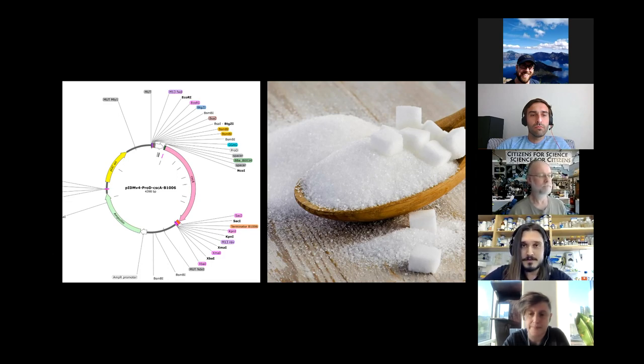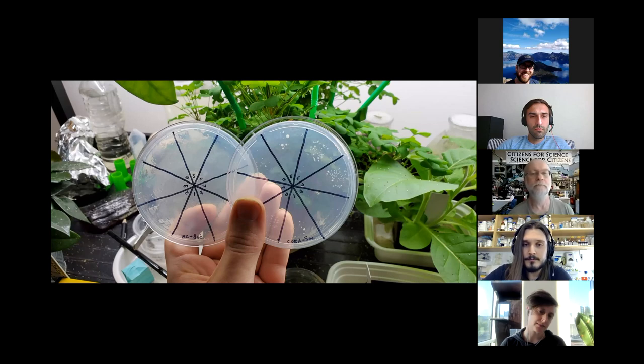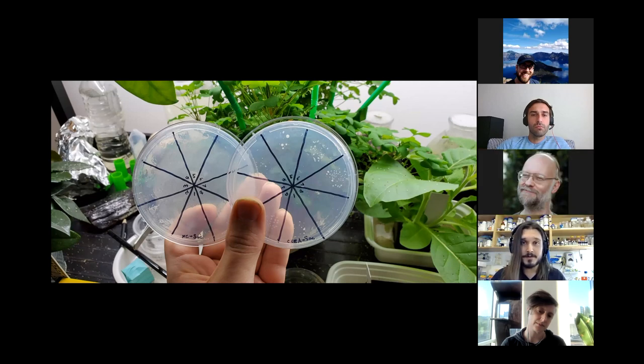In taking the gene from E. coli W and just expressing it by itself on minimal media with just sucrose as the main carbon source, we got this. So on the left is a regular E. coli with minimal media plus sucrose. And on the right is E. coli with the same plasmid carrying the cscA gene in minimal media with sucrose. So we were getting colonies, while on the negative control, we were getting nothing.